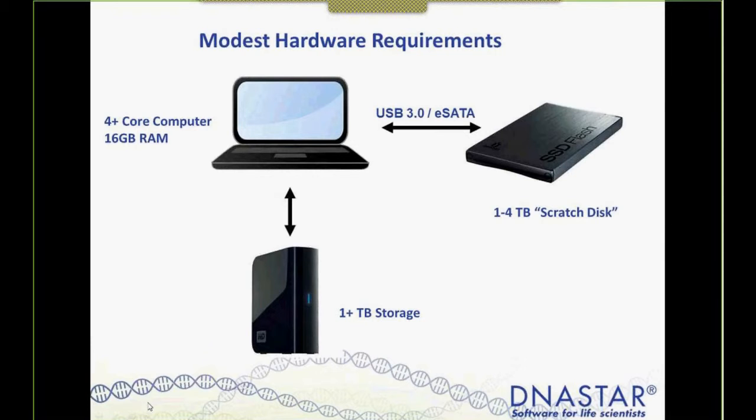The hardware that we're talking about to do these assemblies and downstream analysis is modest hardware. We've designed the algorithms to be optimal on desktop computers. In many cases, laptops are sufficient. And kind of a basic setup for doing alignments, if you're working in a human system and you want to align data to, say, an exome or a gene panel that has genes represented on all the different chromosomes.